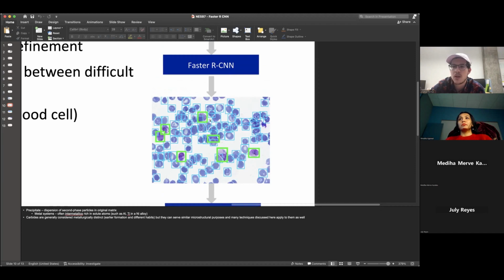It doesn't necessarily learn from successful iterations. I believe it breaks the image down into about 2,000 different possible bounding boxes. Based on what? There has to be some criteria it is using. Is it because it sees a different edge, a different color intensity?